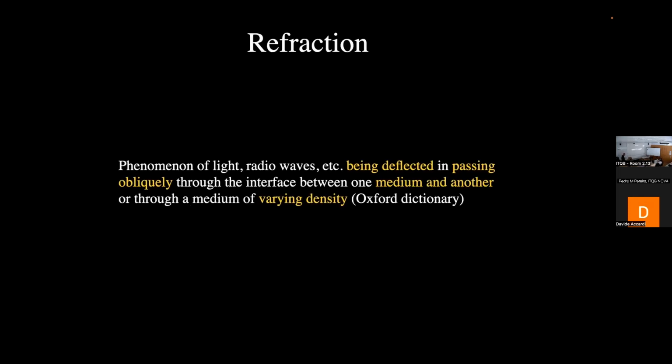This time we start with the definition, and it's a heavy definition to understand. Refraction: phenomenon of light, radio waves, etc. It doesn't matter for us. It's light being deflected in passing obliquely through the interface between one medium and another, or through a medium of varying density.